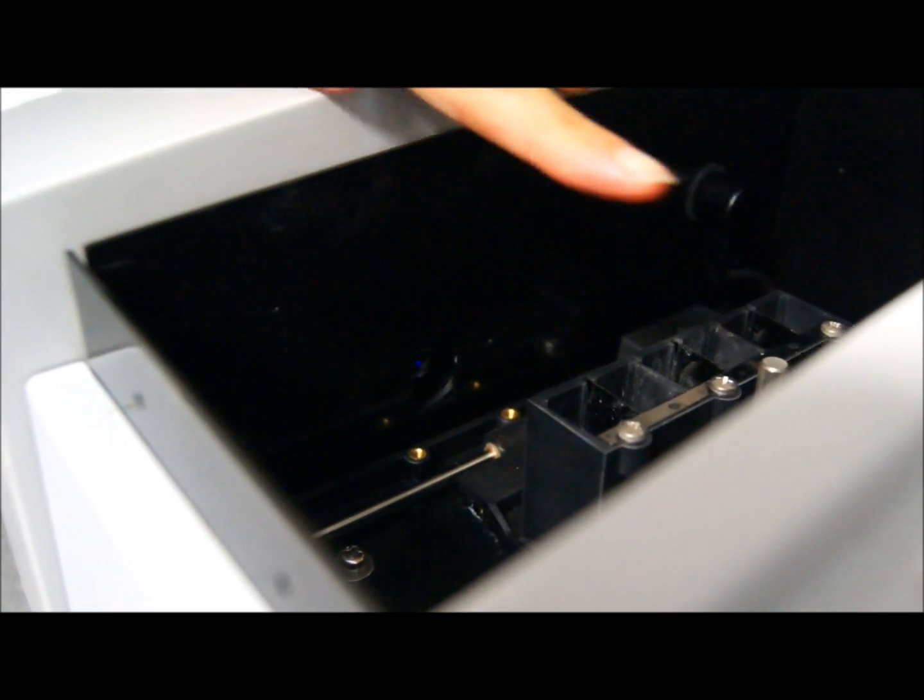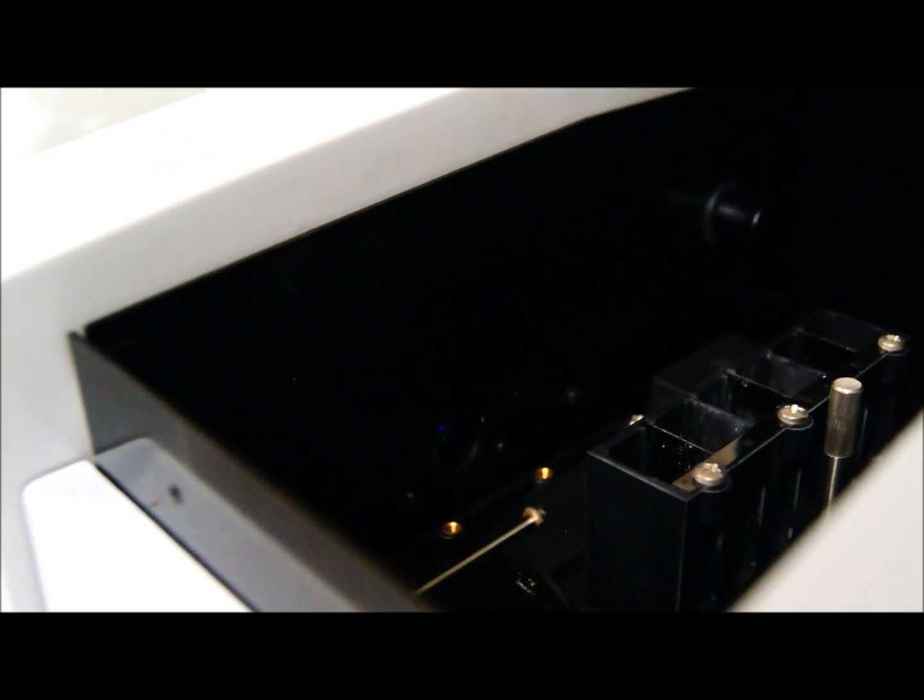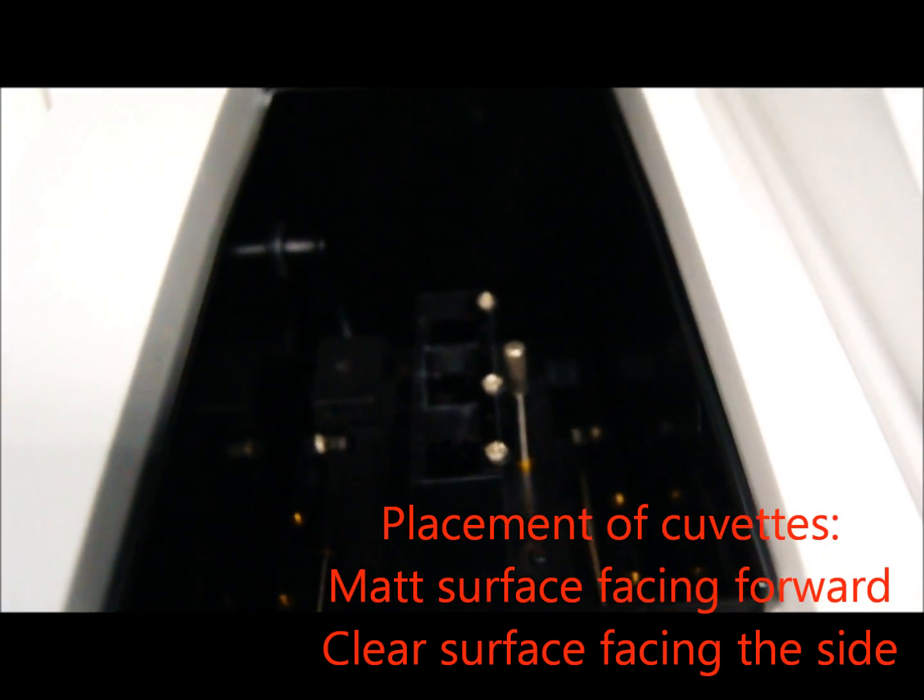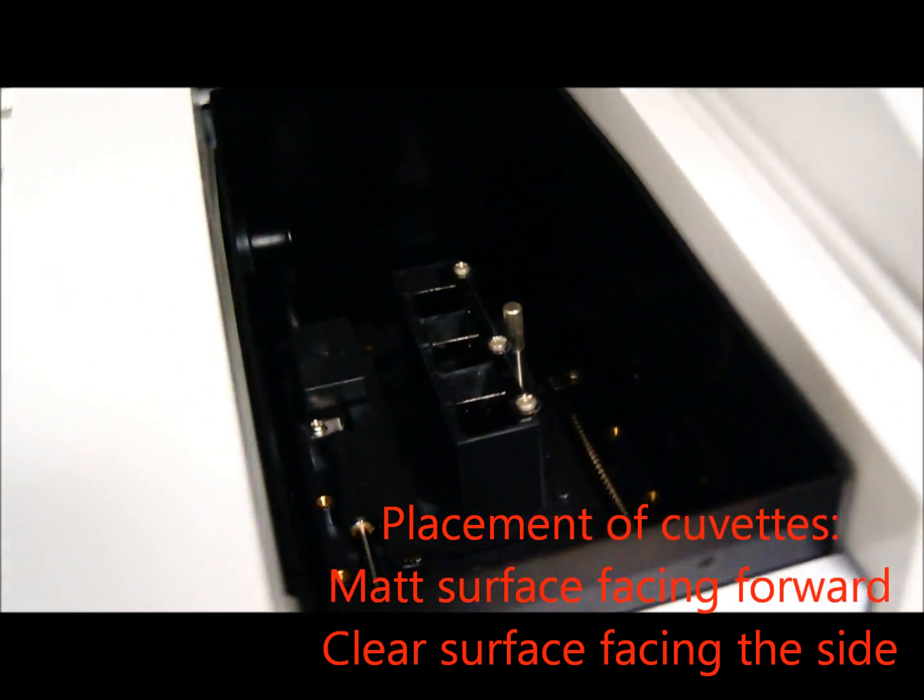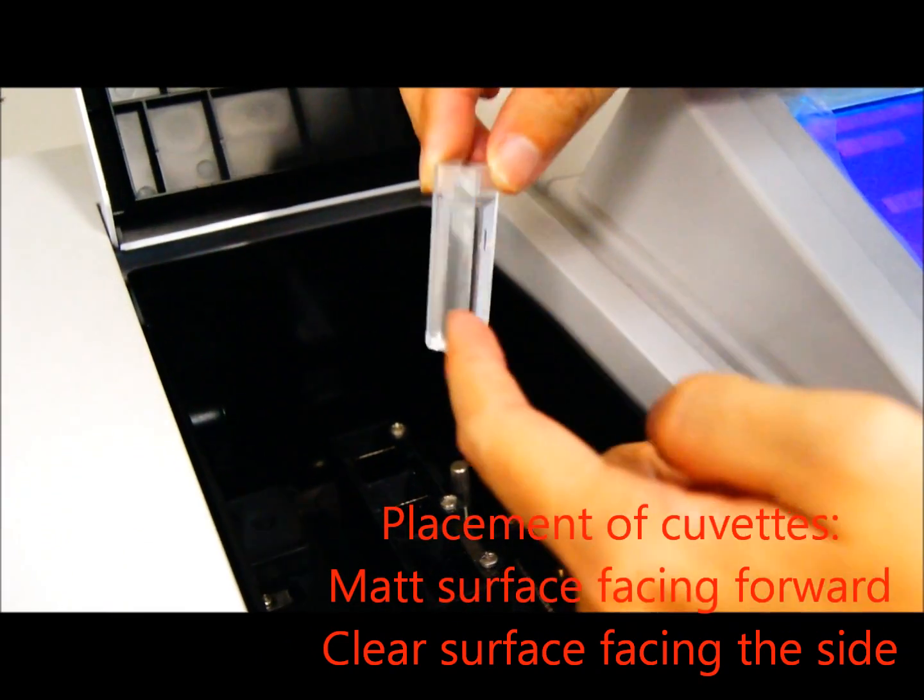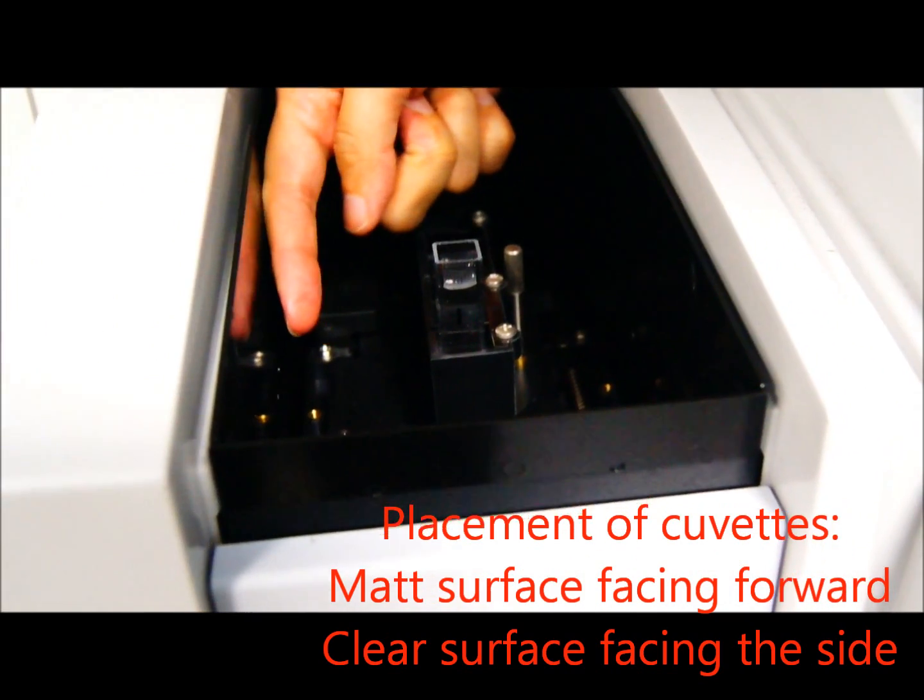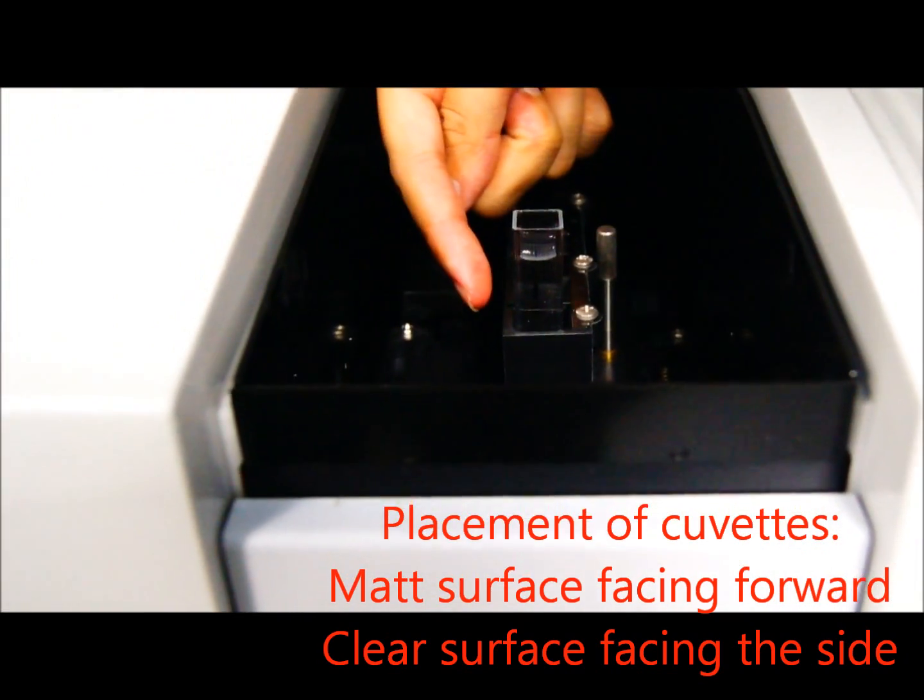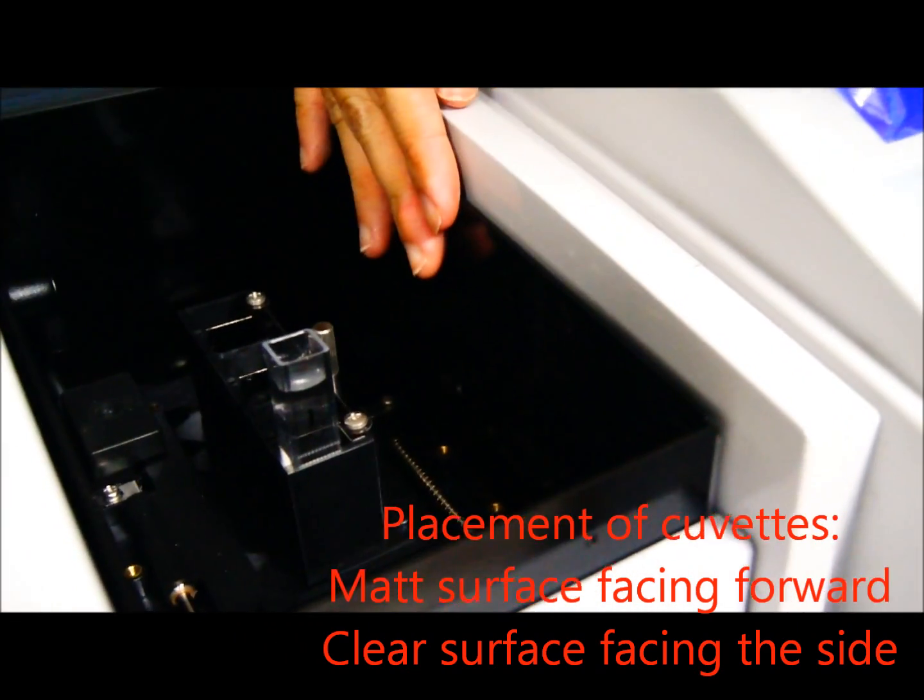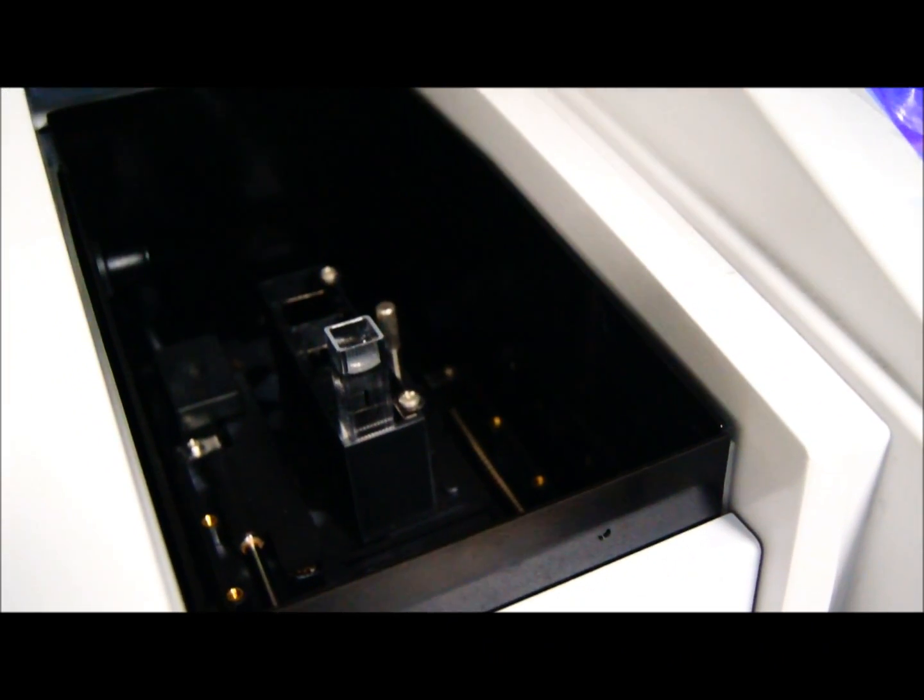The light would come out and then pass through the cuvette, and that's why when we put in the cuvettes, we have to do them with the matte surface facing forward and the clear surface facing sideways so that later on when the light comes out it can pass through the clear surface with no problem and get captured on the other side of the spectrophotometer.